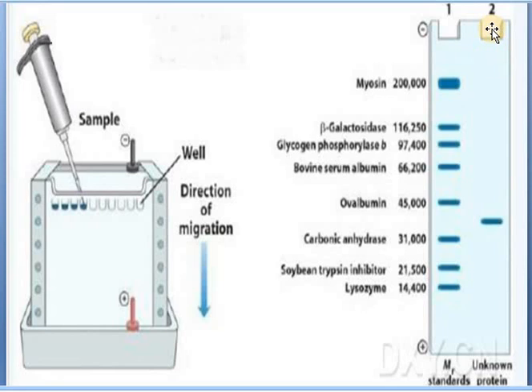Now the sample well 2 contains the sample that we have used for separation. A band is observed in the region close to 31,000 dalton, in between the 45 and 31. With the help of a gel documentation system, a computerized system, we can exactly pinpoint the molecular weight by making a graph, so that we come to a conclusion that the isolated protein has a specific molecular weight. For structural study and molecular findings, this technique is broadly used.